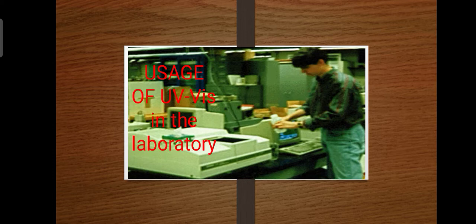So, studying the ultraviolet visible spectra of a molecule provides information on the characteristic energy gaps between molecular orbitals. This information in turn can be used to help identify the molecule. The human eye is able to distinguish among wavelengths in the visible region.